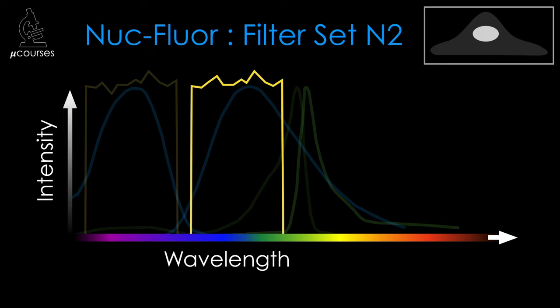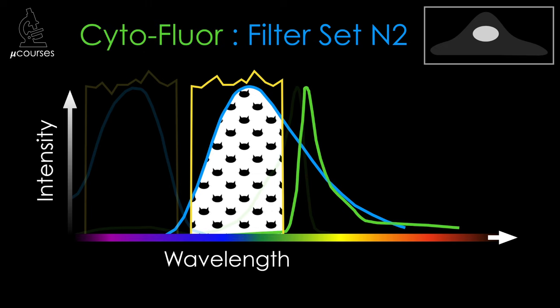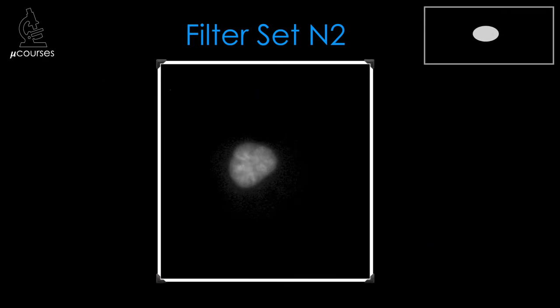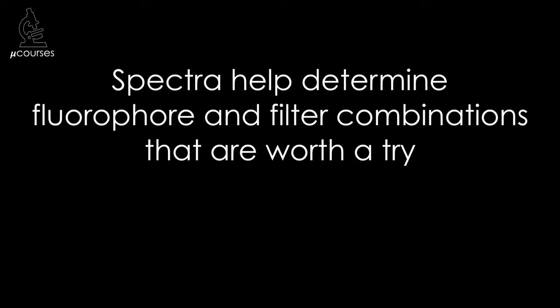Let's see if we can block this bleed-through by using a different filter set to image nukeflor: filter set N2. This set contains the same excitation filter but a different emission filter. The emission filter transmits less of the emission from nukeflor than the previous one, but still gets the majority of it. Unlike the previous emission filter, this one blocks the emission from cytoflor. So when images are collected using filter set N2, we no longer see signal in the cytoplasm. Examining spectra is useful for choosing fluorophores and filter sets less likely to result in bleed-through.